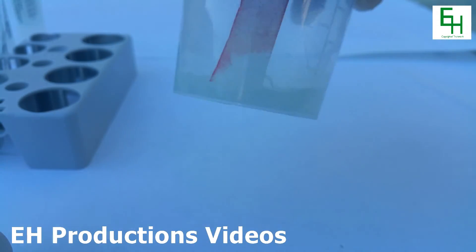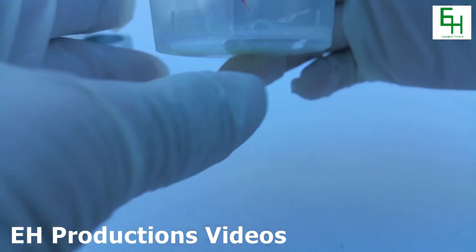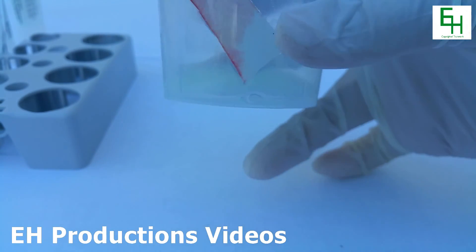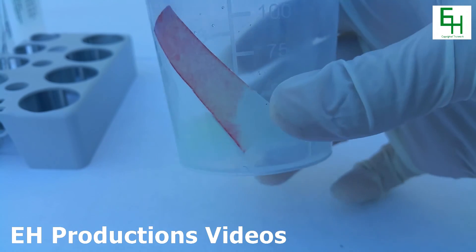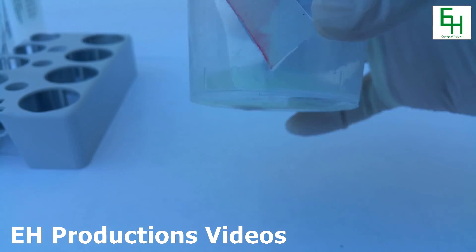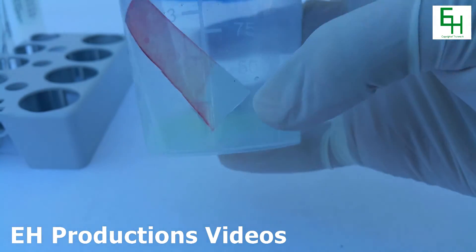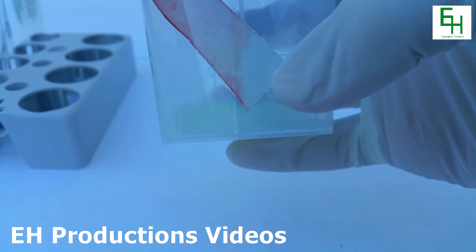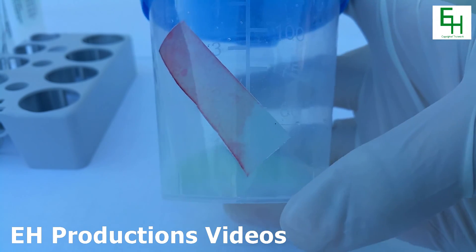Now I'm going to give it a quick shake to eliminate any of the chlorine that has been in there. Now you can see that the sodium thiosulfate doesn't bleach the litmus paper, but instead it washed away the potassium permanganate stains over here that the chlorine bleached.